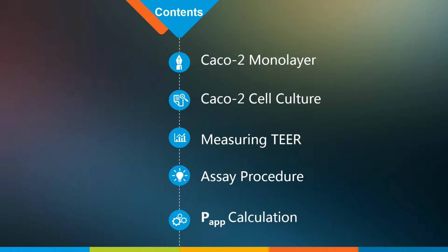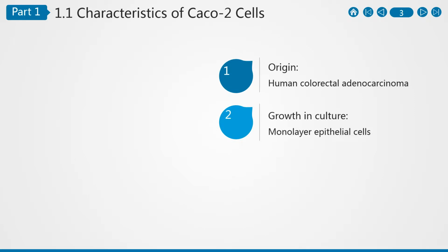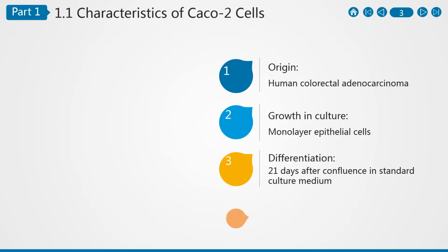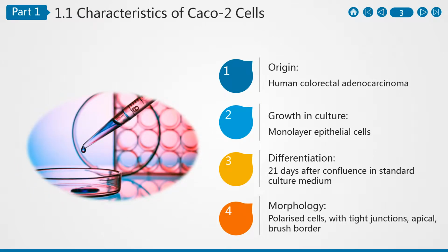The experimental procedure is comprised of two parts: the cultivation of the Caco-2 cells on filter supports and the drug transport experiment. The Caco-2 cell line is a continuous line of heterogeneous human epithelial colorectal adenocarcinoma cells. Although derived from a colon carcinoma, when cultured under specific conditions the cells become differentiated and polarized such that their phenotype, morphologically and functionally, resembles the enterocytes lining the small intestine.